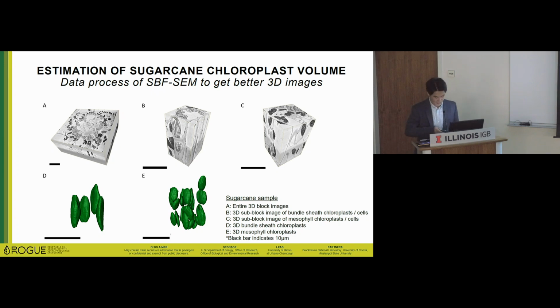He asked me, where's the vacuole and where's the other space? But in this case, I can only quantify the chloroplasts and cell wall. First, I'm sorry for presenting this kind of partial data, because I haven't put in all of the quantified information. I will let you know later individually.